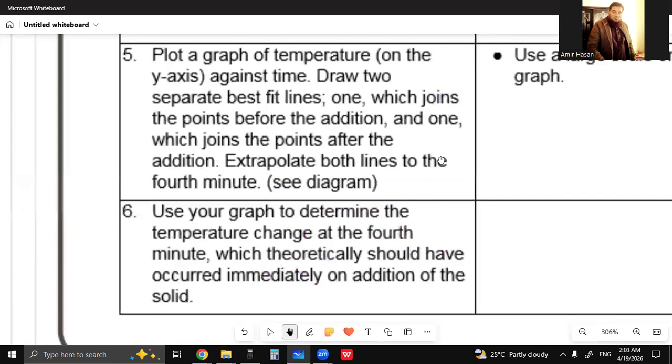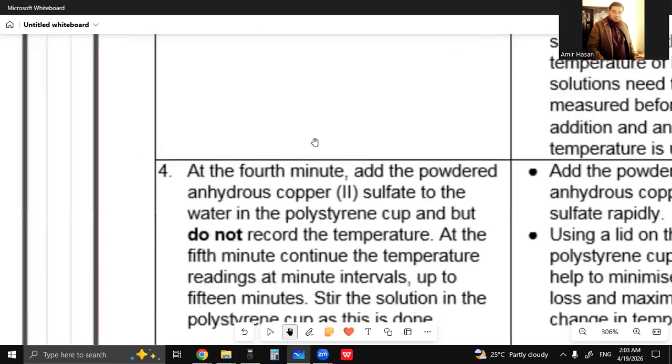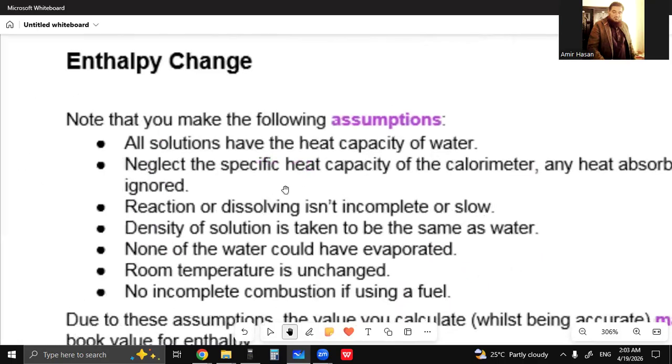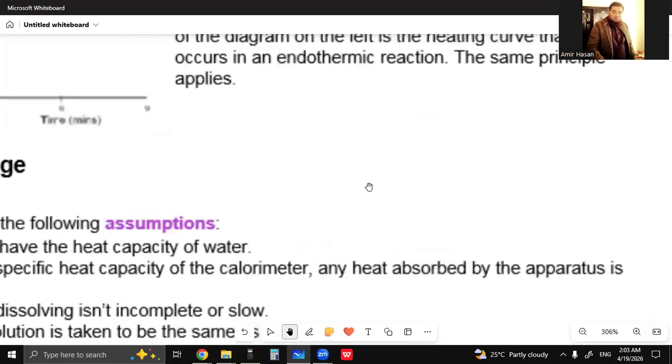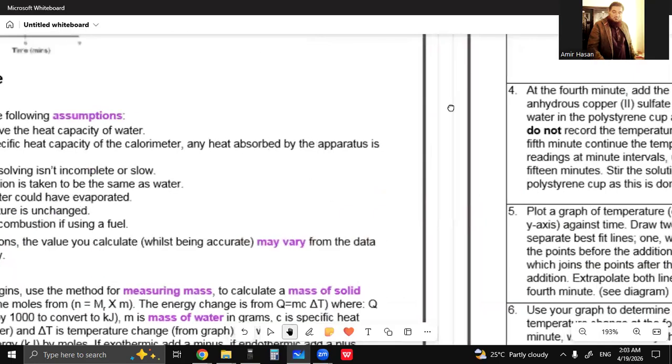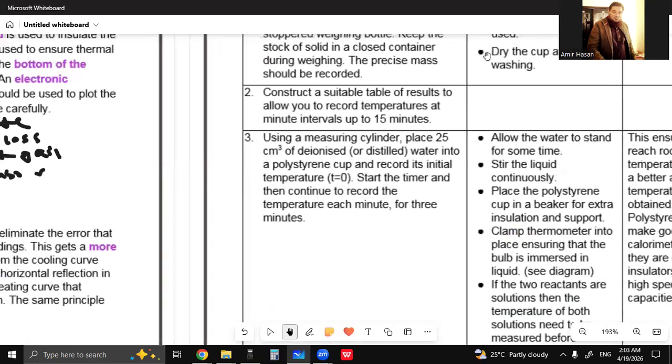We know the temperature, we know the mass, and we use the same assumption, the specific heat being near to that of water. We use the formula Q = mcΔT with the help of this. And for the number of moles, we use this formula, and we get the number of moles easily. When we do all these steps, we get the reading or enthalpy change accurately.